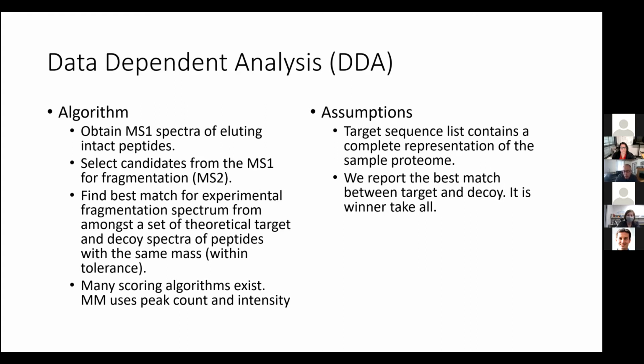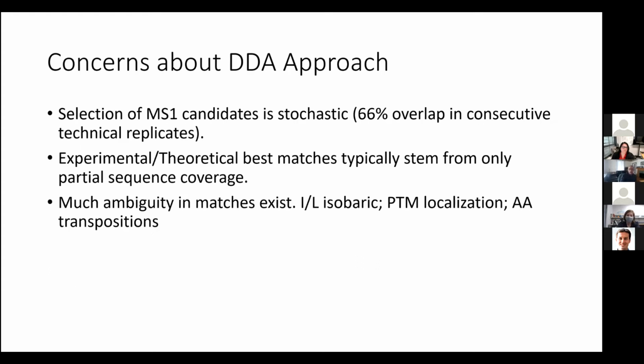Every experimental spectrum basically gets matched to one thing. And if the best match happens to be a decoy, then that's what we assign it. Okay. As I mentioned, there are some concerns with this approach.